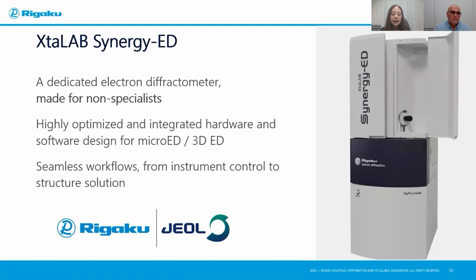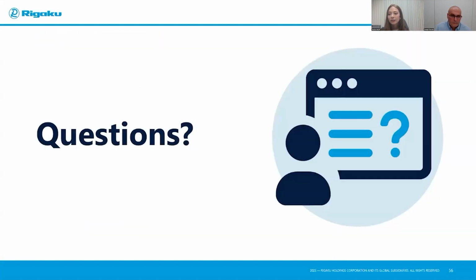And I hope that I've been able to show you that electron diffraction is really developing into a broadly accessible technique that enables us to perform unique experiments with powder materials, and it can be just as straightforward as other crystallographic analyses as well. With that, I would like to conclude, and we'll take any questions that we have time for.